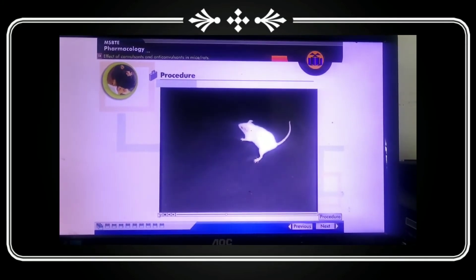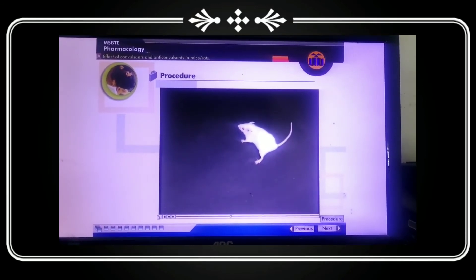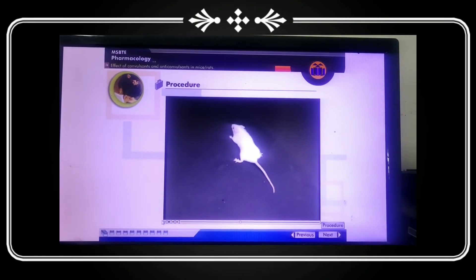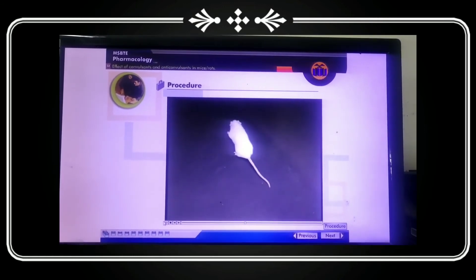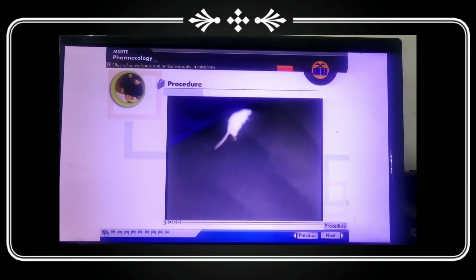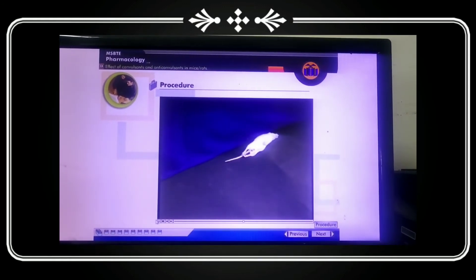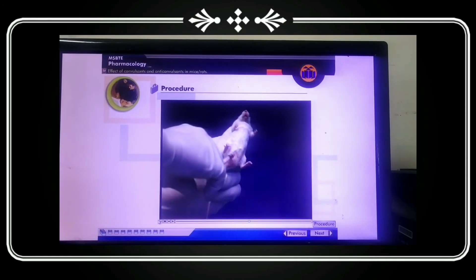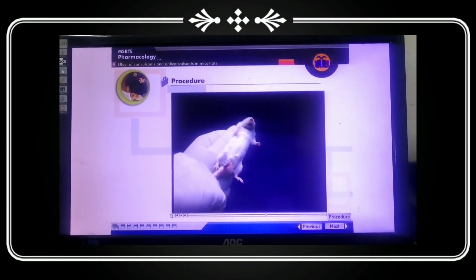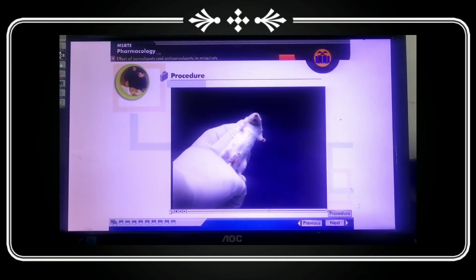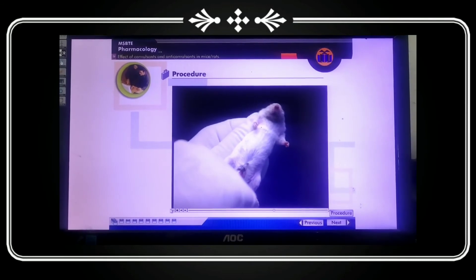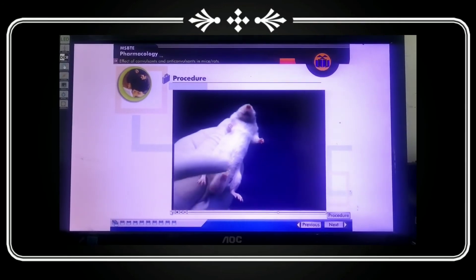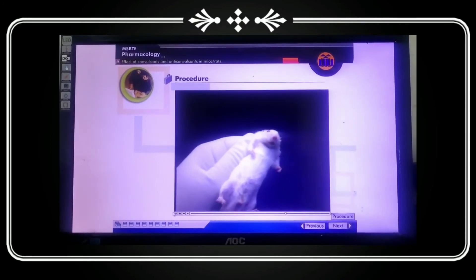Now we will observe this animal. You can see that there is some tonic spasm — impairment of brain functioning. The convulsion produced is widespread in the brain. You can see jerking of the body. Strychnine has produced the convulsion. Now we will give the anti-convulsant drug diazepam. After administration of the anti-convulsant drug diazepam, the animal will show normal behavior and normal activity.